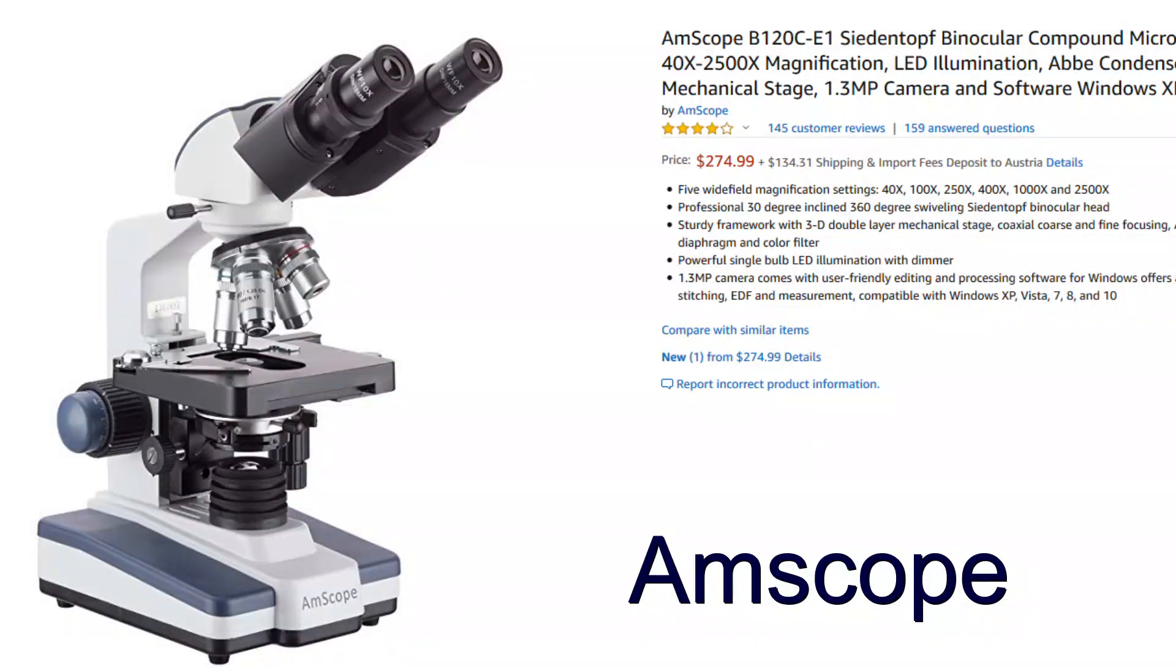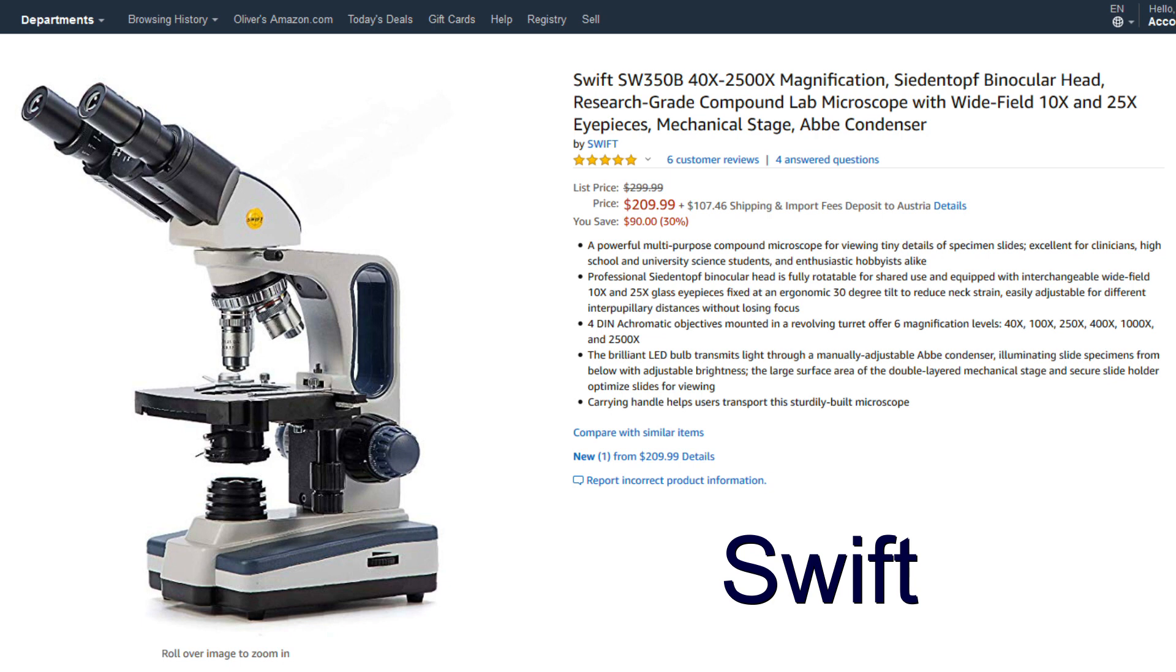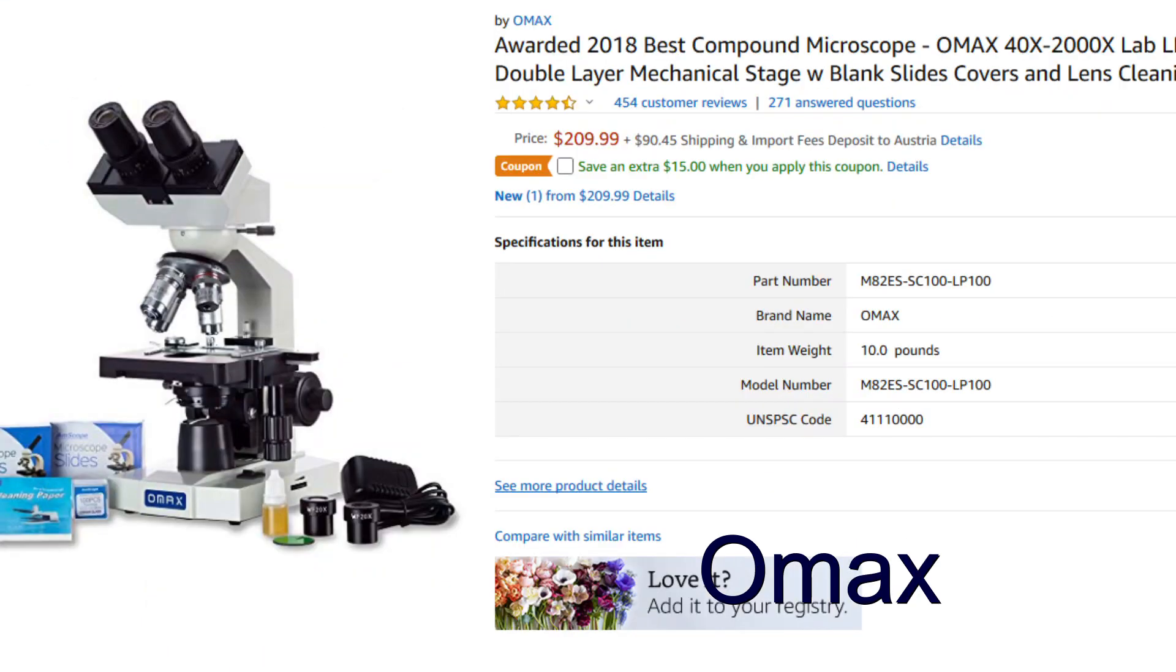And this is actually something that many companies are doing. They are basically buying the same optics, the same objectives, and then they're simply attaching them to their microscopes and they're rebranding it. And in order to show you that this is actually the case I actually went into Amazon.